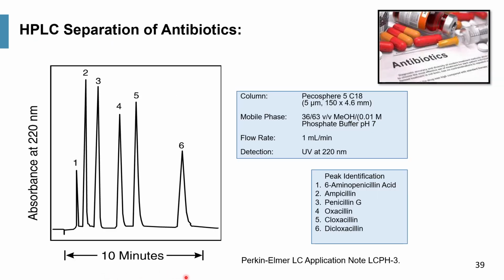Once again, an application from a PerkinElmer application note on the separation of an antibiotic using this particular column with trifunctional silane chemistry.